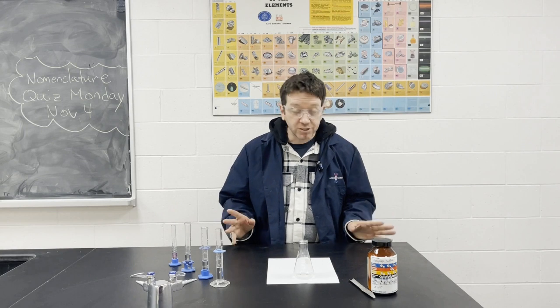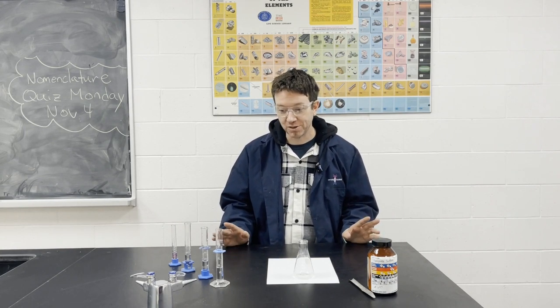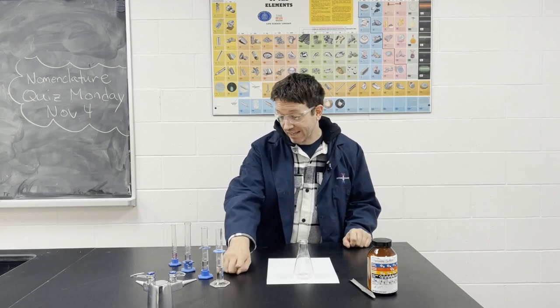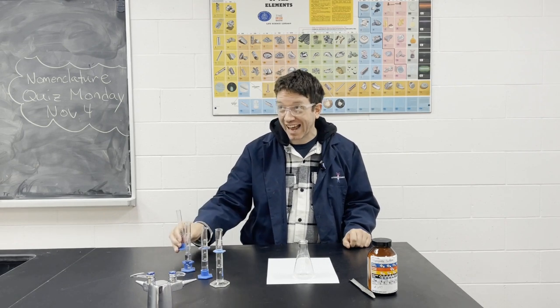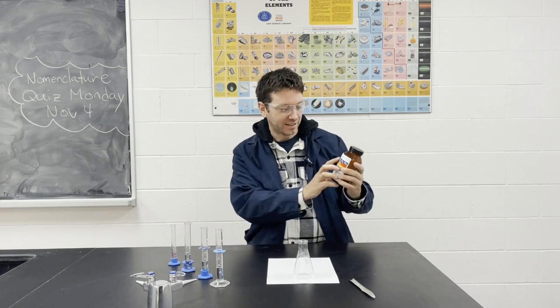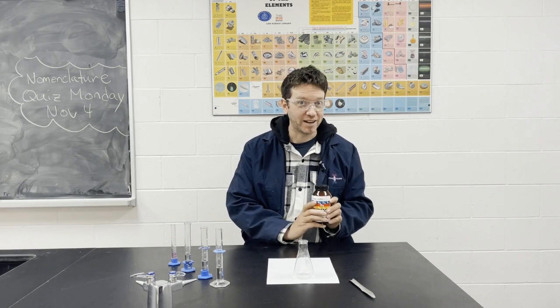All right, in these next two reactions, we're going to test possible catalysts with our rate of reaction. So we have our 10 mils of sulfuric acid, 10 mils of oxalic acid, 10 mils of distilled water. We have our 4 mils of potassium permanganate. And then we're going to add as a possible catalyst manganese sulfate. Let's see how that affects our rate of reaction.